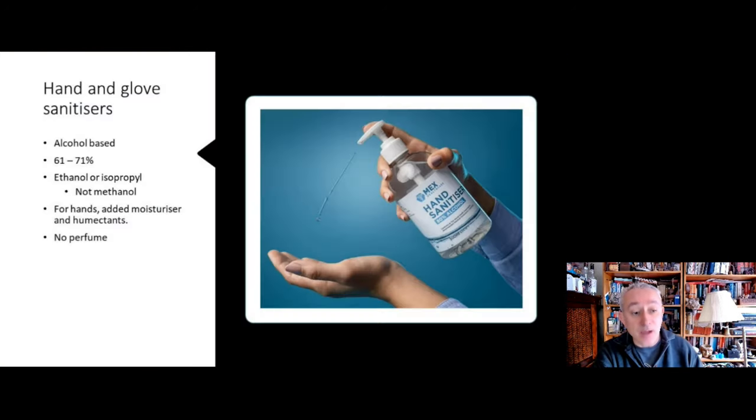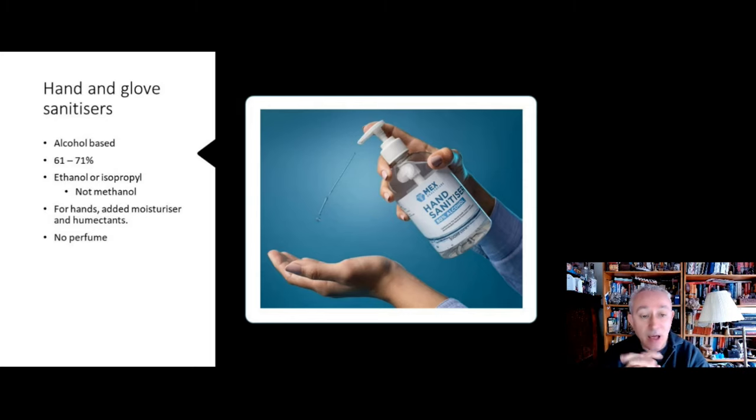Just a quick thing about sanitizers themselves. They are alcohol-based and the effective range is between 61 and 71 percent alcohol, and the optimal alcohols to use are either ethanol or isopropyl alcohol. Something like methanol is not allowed to be used because it's highly toxic. For bare hands, ethanol is best and we tend to use denatured ethanol which has some added moisturizer and also chemicals that are called humectants. These are ingredients that you might find in household lotions and cleansers and they help to hydrate the skin because they attract water molecules like a magnet. It's also very important that no hand sanitizers contain any perfumes because the perfumes can interfere with the efficacy of the sanitizer, so we go for non-perfumed sanitizers for both bare hands and for gloved hands.